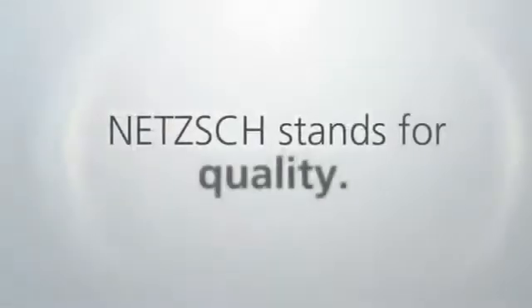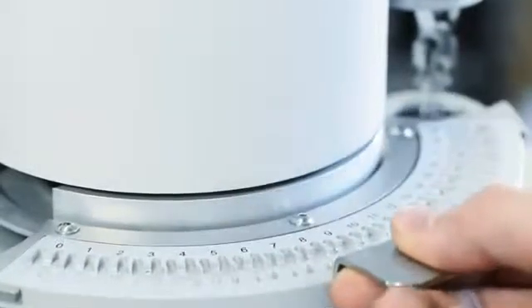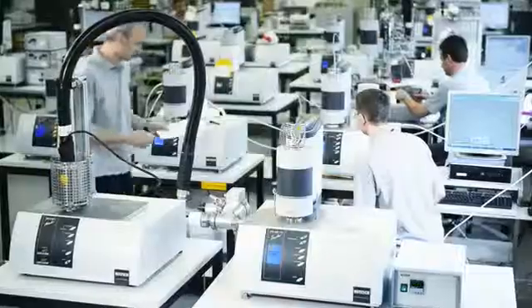NETZSCH stands for quality. Every instrument is subjected to rigorous inspection and all functions are tested under real-world conditions.